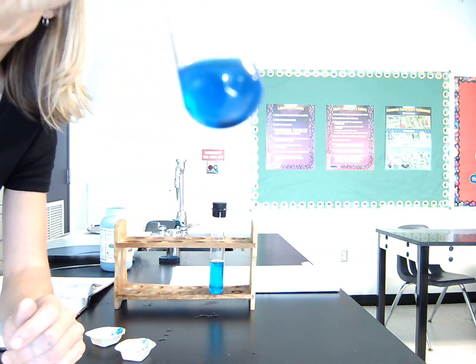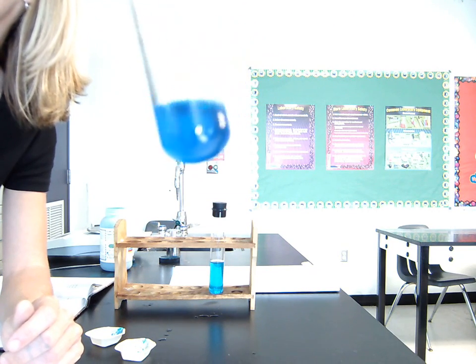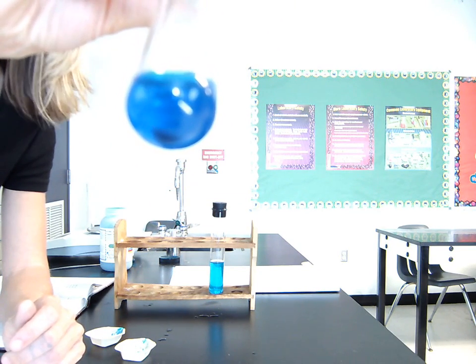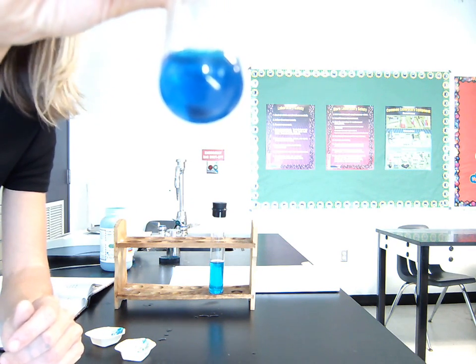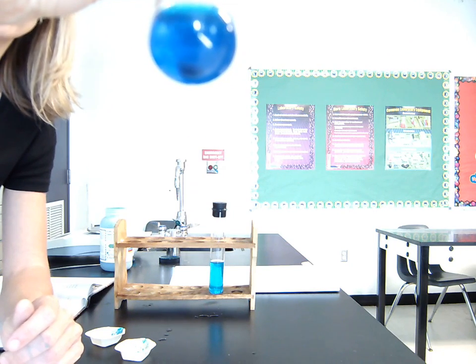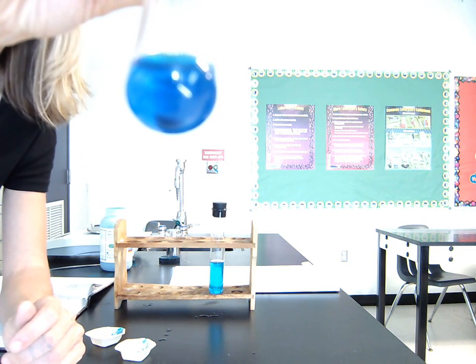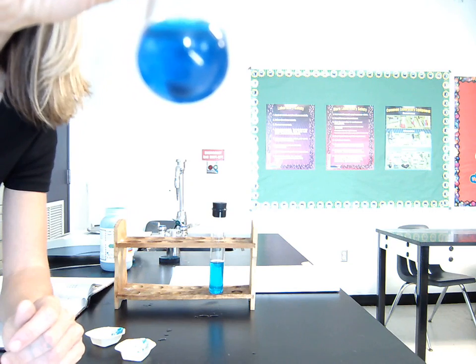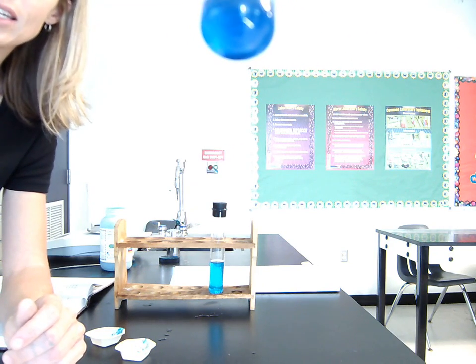We call this a saturated solution. So again, there's another vocabulary term that you definitely need to know. A saturated solution is a solution in which no more solid, or I should say substance, will dissolve. Now, the only physical evidence that I have that this is a saturated solution is that I can physically see that there is blue solid left in the bottom of the test tube that will not dissolve. So, in order to be able to prove that a solution is saturated, you have to be able to see that there is stuff left that will not dissolve.